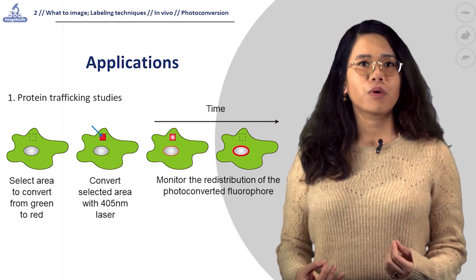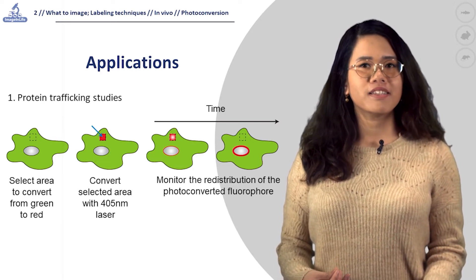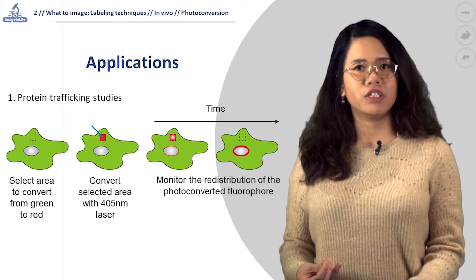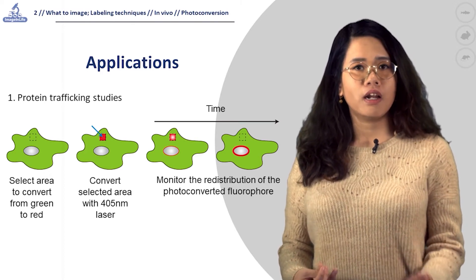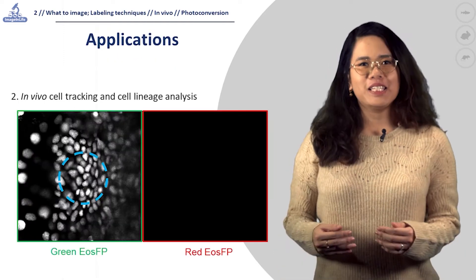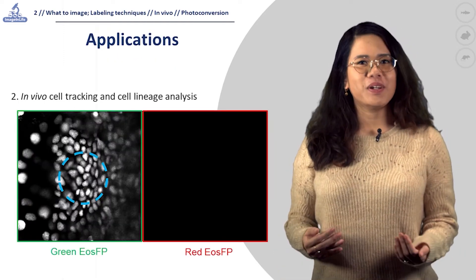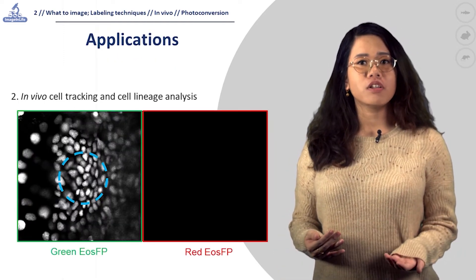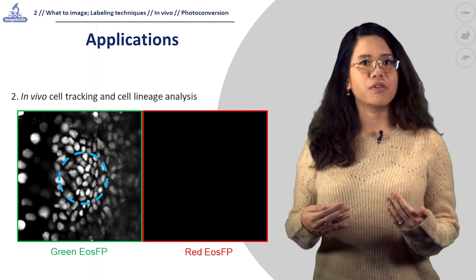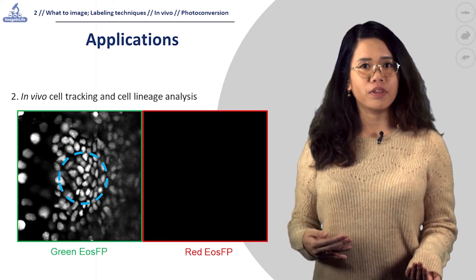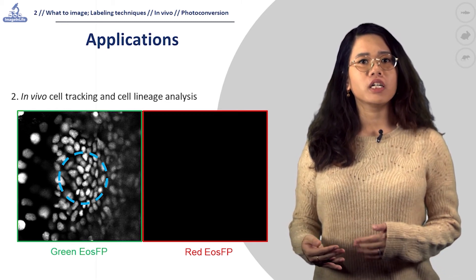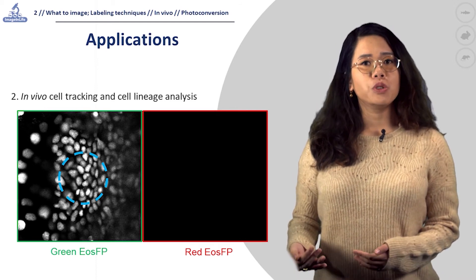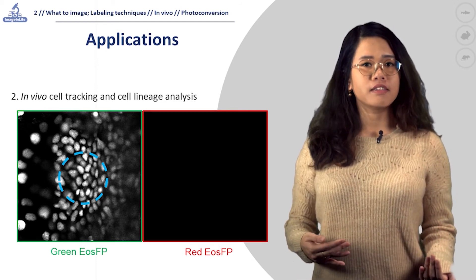Using photoconvertible proteins allows us to select and highlight a subpopulation and monitor the changes in their localization over time. Similarly, to label a small group of cells to visualize their morphologies or observe their migratory behaviors within living tissue could require complicated and time-consuming cloning strategies to obtain stable transgenic lines.